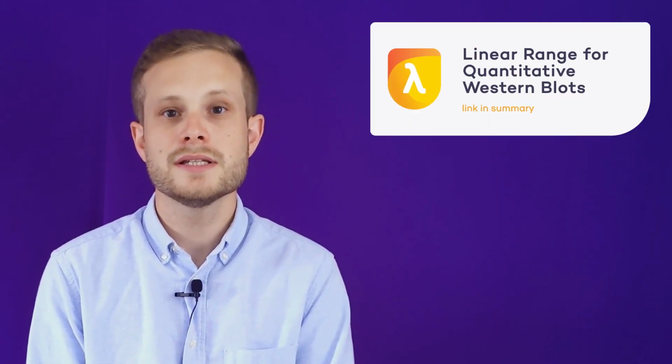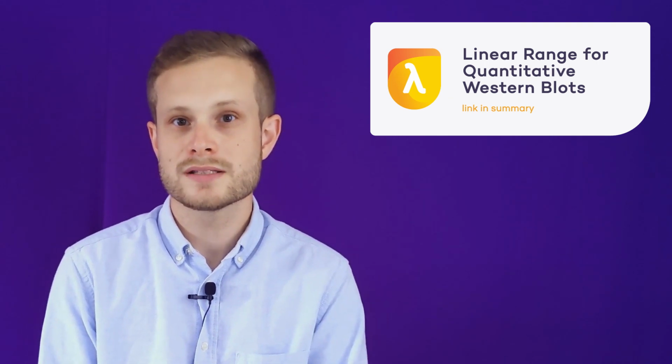With optimized detection hardware, such as an Odyssey family imager, signals at these two wavelengths can be detected completely independently, and can allow for detection of two targets across their whole combined linear range. For more information on why determining the combined linear range is critical for a quantitative Western blot assay, and some advice on how to do so, please consult the Linear Range for Quantitative Western Blots course here on Lambda U.